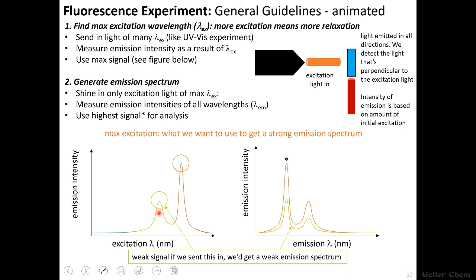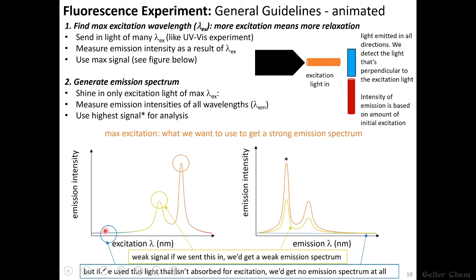But because this particular wavelength isn't absorbed as much in the first place, it doesn't produce as much subsequent fluorescent emission. But if we were to send in, say, this wavelength, well, that's not exciting the molecule at all, which means there's no emission at all.